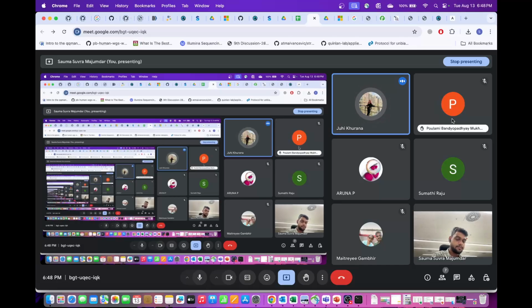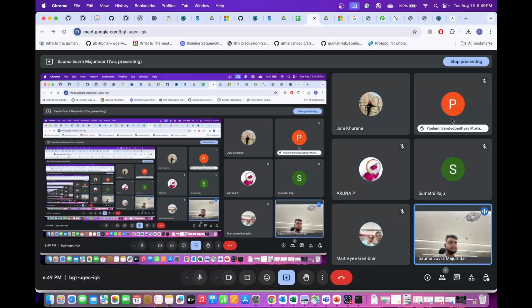So, if we are interested in the viral genome, can we do viral genome VCF analysis? Can we do it for viruses? Yes, viral genomes. The thing is, the basic stuff does not change much.